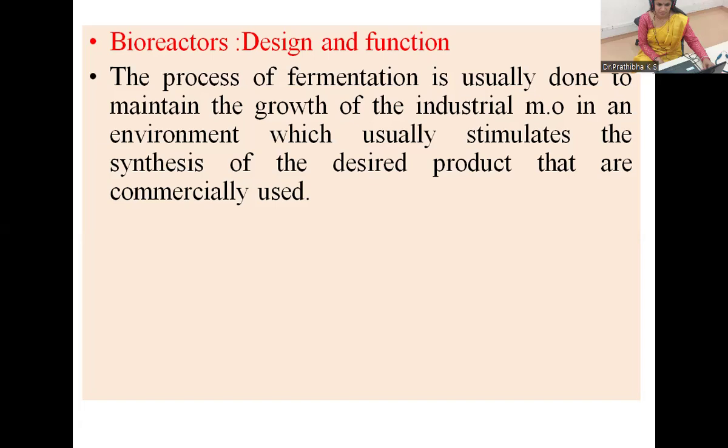Some of the core concepts like biocatalyst, bioreactor, and also upstream processing, downstream processing, fermentation, and media we study here. So all these we are studying to obtain different varieties of microbial products like pharmaceuticals, food and beverages, biofuels, different agriculture products, and genetically modified organism products, and so on. Now let us focus on the bioreactor design and its functions.